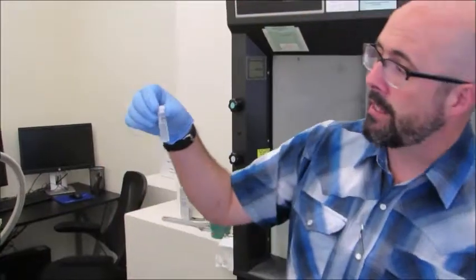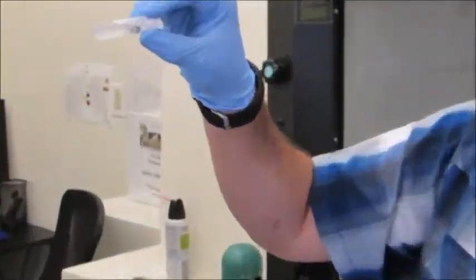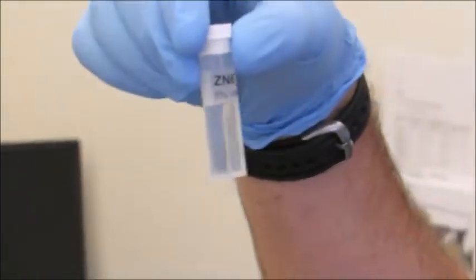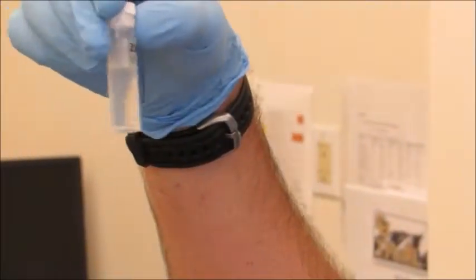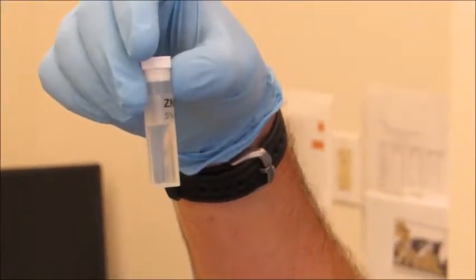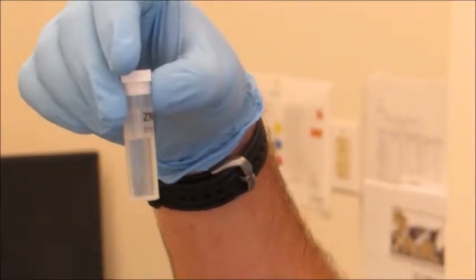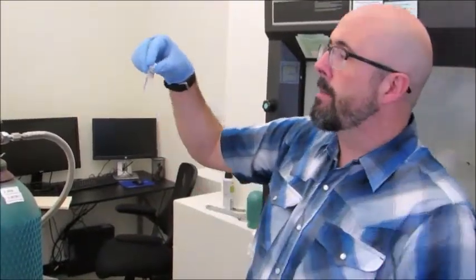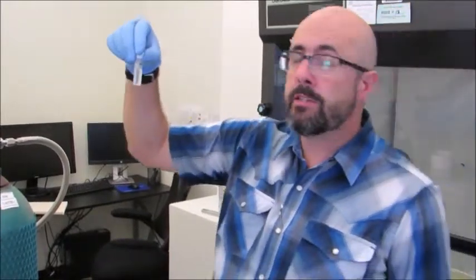But after we do the dissolutions, what we're left with is something like this. It's a clear solution, and what this is, is one zircon crystal, one of those little metal packets we saw in there, with one zircon crystal in it, that's been dissolved using an acid vapor dissolution technique, where it takes about a week and a half under pressurized boiling hydrofluoric and hydrochloric acid. That dissolves the crystal, we then dilute it up, and we get this solution. It's about 2 milliliters of sample with one zircon dissolved inside of it.